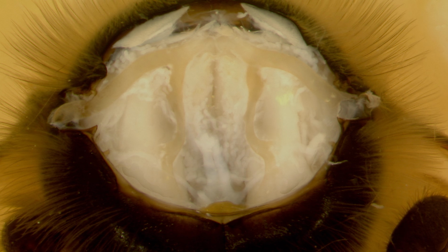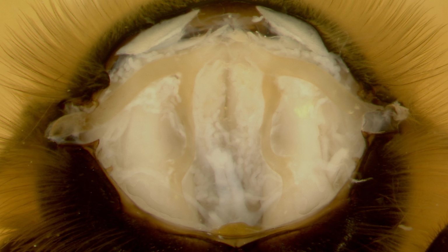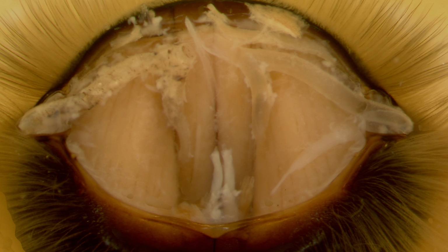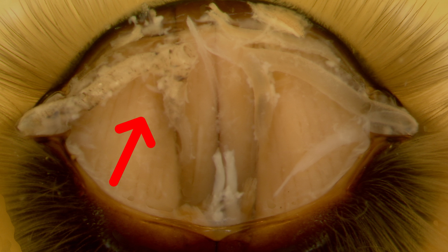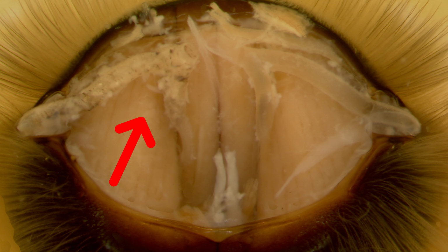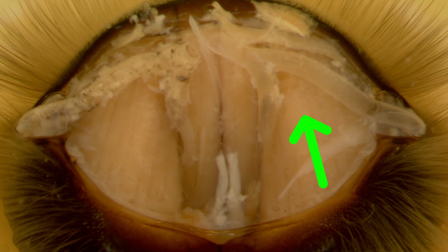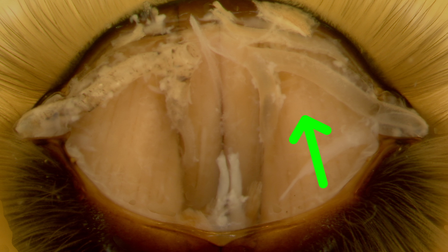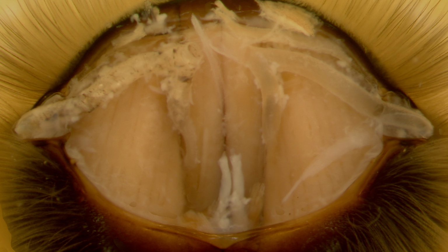This is a picture of two tracheal tubes that are free of tracheal mites. This is a picture where one tracheal tube has both those white globular structures as well as the melanization damage, while the other tracheal tube is free of tracheal mites. So you can get a good side-by-side comparison of an infested tube and an uninfested tube.